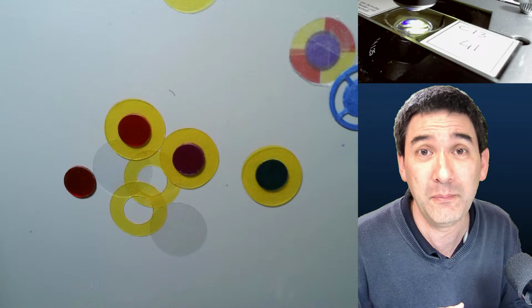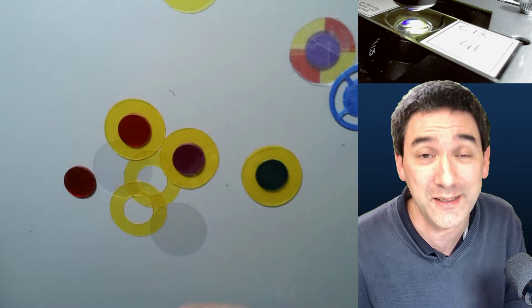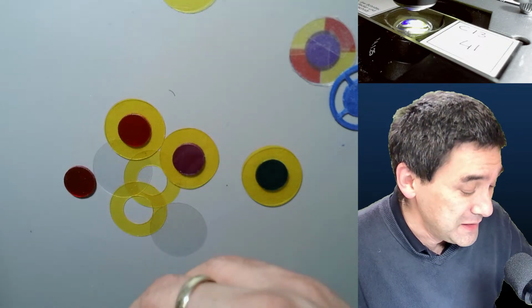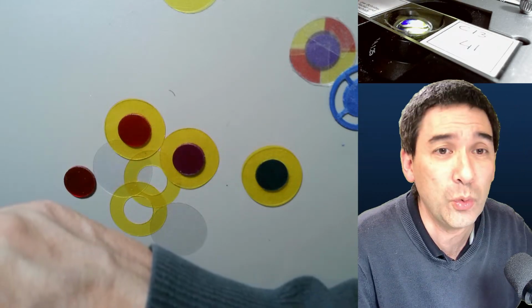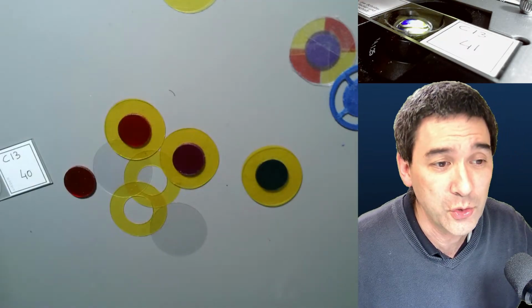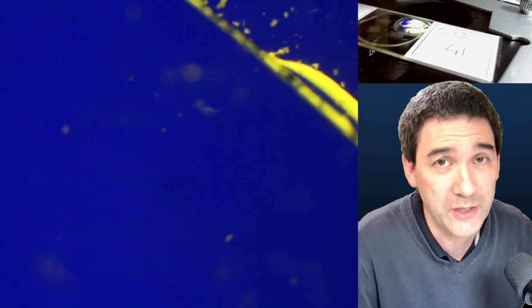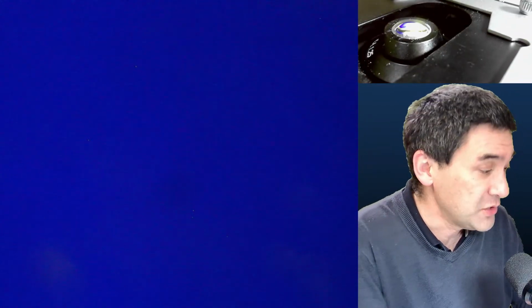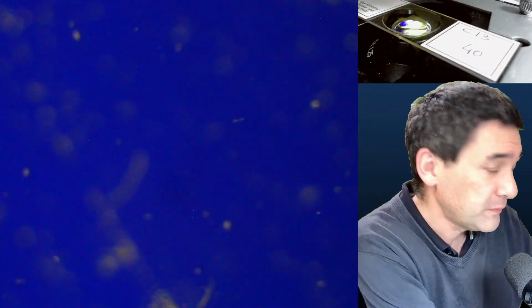And then I discovered another reason: there is so much empty magnification added. So that makes it really difficult to give certain advice here. Generally what I say is, if you want to take occasional images through your microscope, maybe try to connect a mobile phone. But then again, that's not very stable either. So each system has its own disadvantages and advantages.